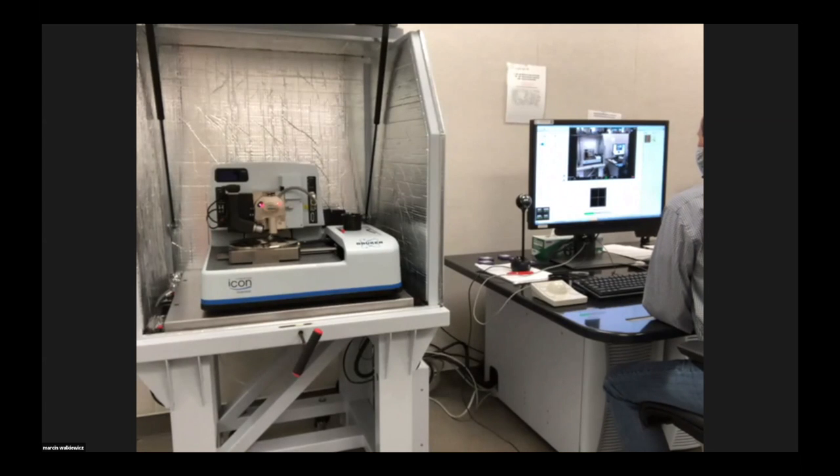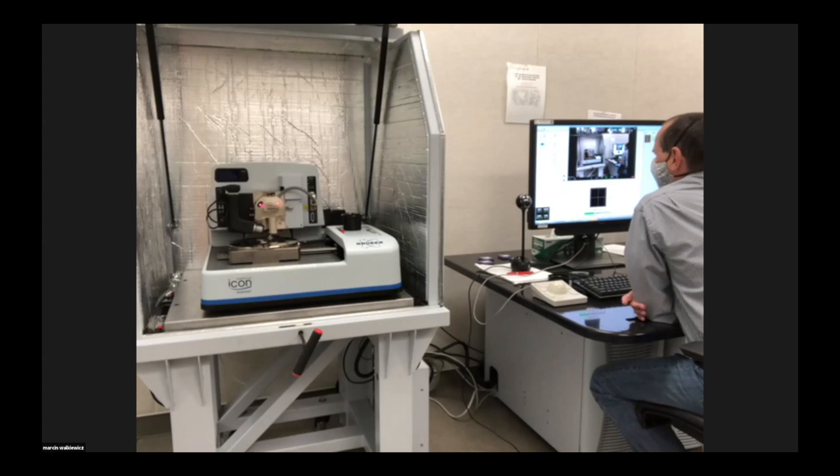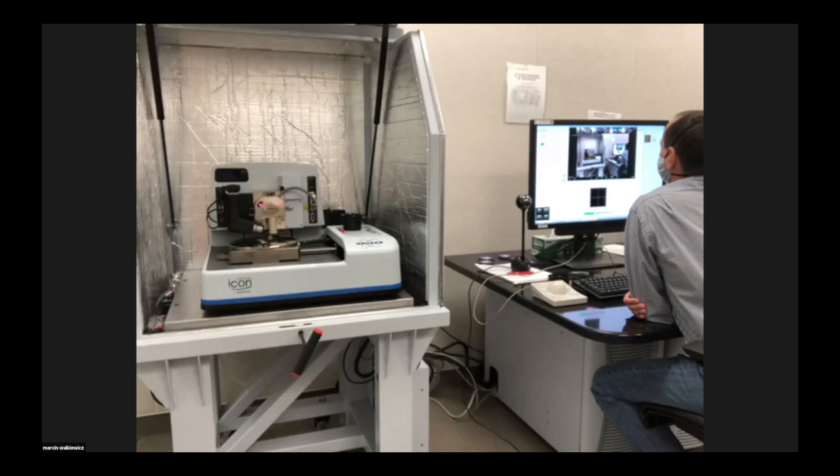But also for context, the instrument is actually in the basement of the building. So it is underground and between two buildings or under the building? Between two buildings, yes. And part of that is to isolate, again, from any sort of vibrations, because we do have big delivery trucks, you know, typically driving around, and those vibrations can impact your data taking. So if you're thinking about becoming a scientist, that's what's going to happen. They're going to put you in a basement.